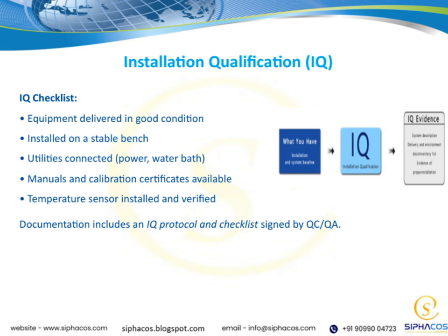It's equally important to have all manuals and calibration certificates readily available, as they provide essential information for proper use and maintenance. One key aspect is installing and verifying the temperature sensor, especially if precise temperature control is part of our process. This step ensures the sensor is functioning correctly and providing accurate readings.